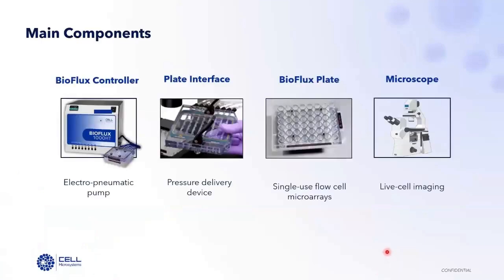The BioFlux controller is a benchtop electropneumatic pump that generates controlled air pressure and provides precise temperature and gas control, and it also drives flow through the microfluidic channels inside BioFlux plates, which are the only components through which fluids flow.